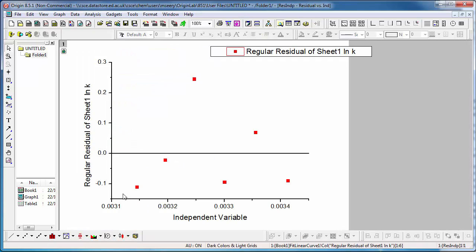Here we see the residual plot. Double-clicking makes it larger. What are we looking for? In general, a residual for a good fit will show random scatter either side of the fitted line, represented by the 0 line here. There should be no obvious trend on one side or the other, for example, all points below the line at one end of the plot and above the line at the other, or a gradual drifting of the scatter one way or the other. This residual looks okay. Perhaps the highest data point is skewing the data somewhat.